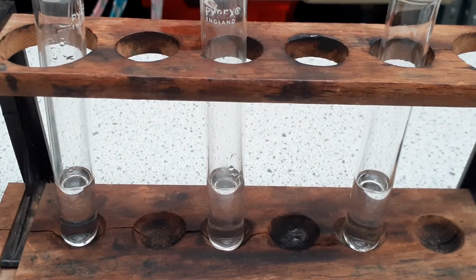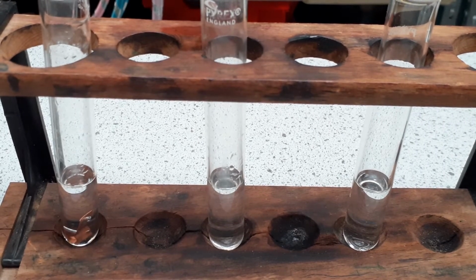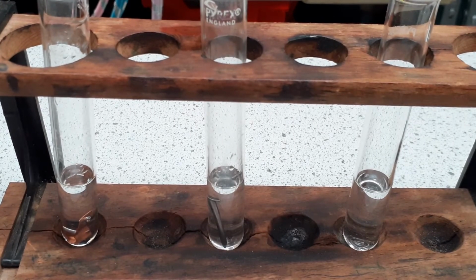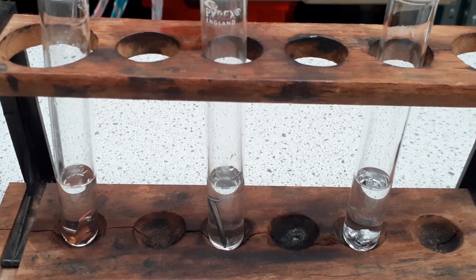So, magnesium sulfate, piece of copper, piece of iron, and a piece of zinc. Now, we will leave these to react, and then we will look for signs of reaction occurring.